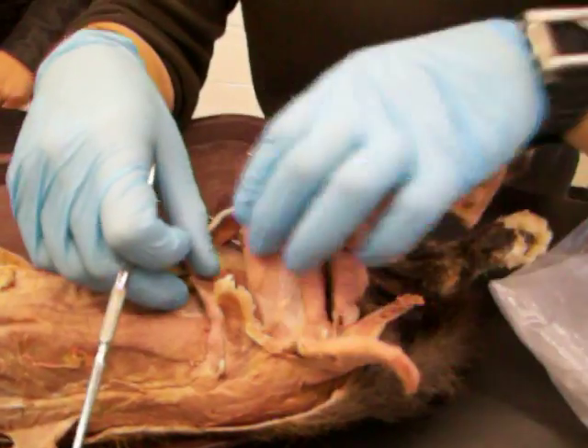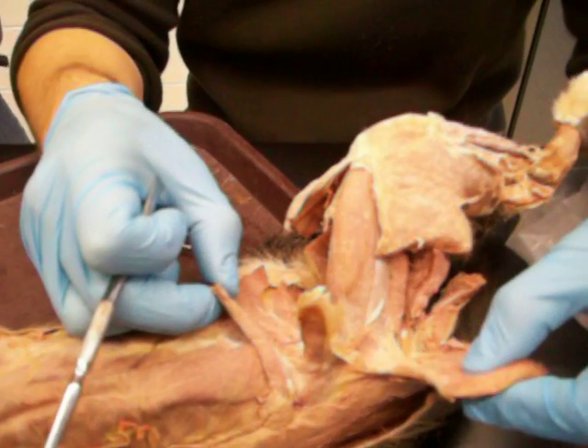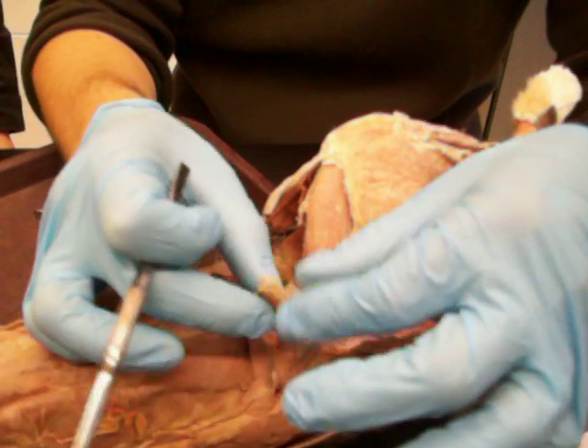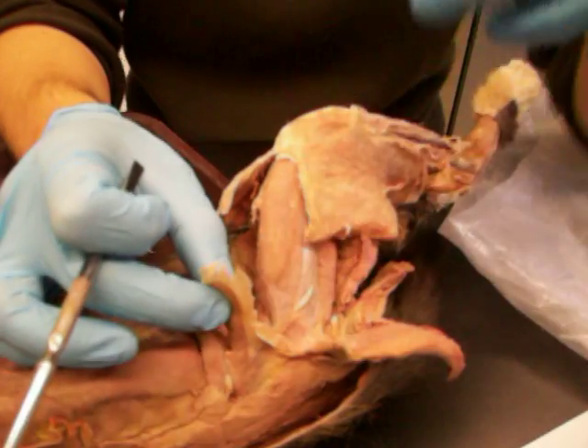The big flap on the outside is the biceps femoris. There's the sartorius and the gracilis. Between the sartorius and the biceps femoris is the iliotibial band — there's a nice little fascia still attached to it, also called the tensor fasciae latae.